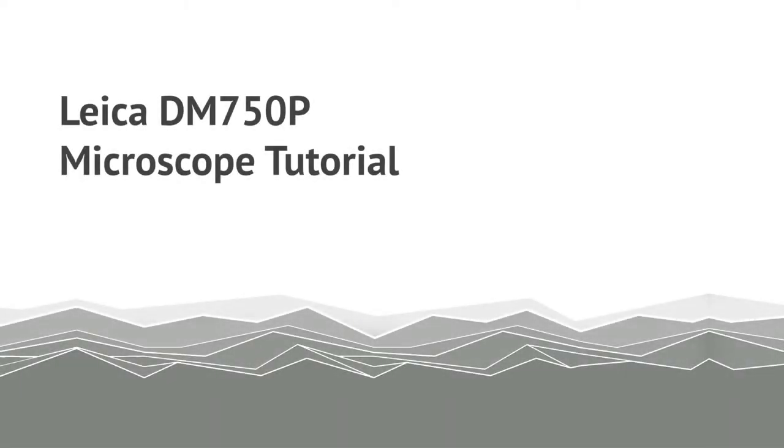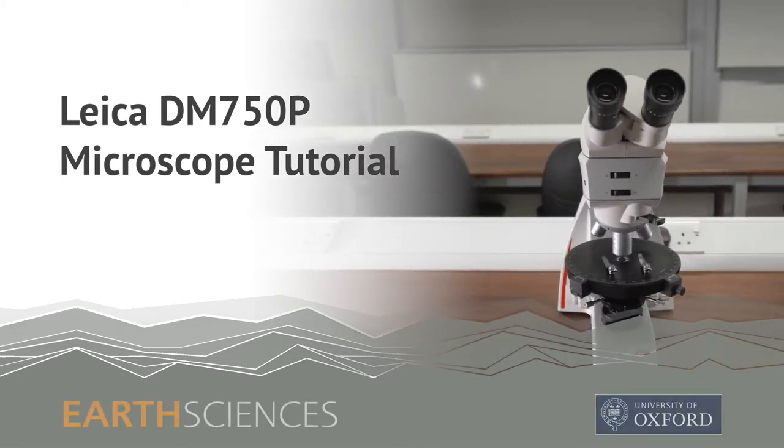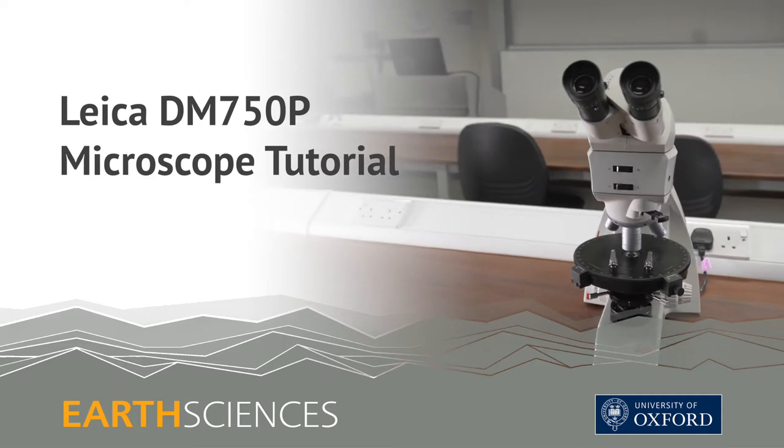This is a University of Oxford Earth Sciences Department tutorial on how to set up the Leica DM750P teaching polarising microscope.